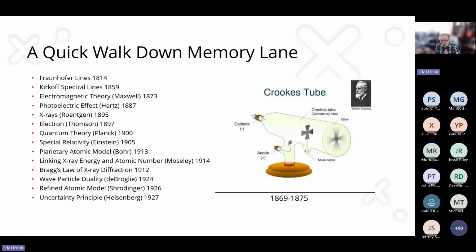And if you draw your attention over here to the right-hand side of the image, you'll see that way back in the latter part of the 19th century, people had developed some fairly primitive vacuum systems. They were developing some battery technology. And so they were studying electrical conductivity.